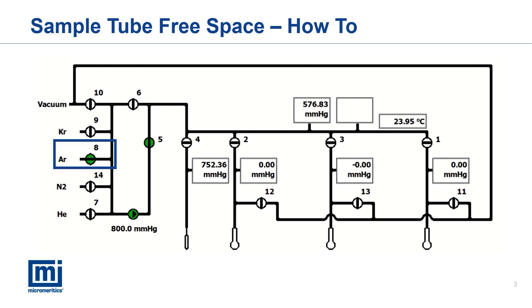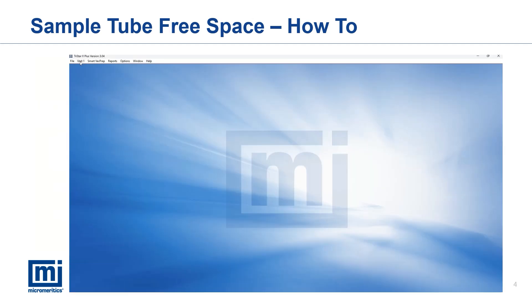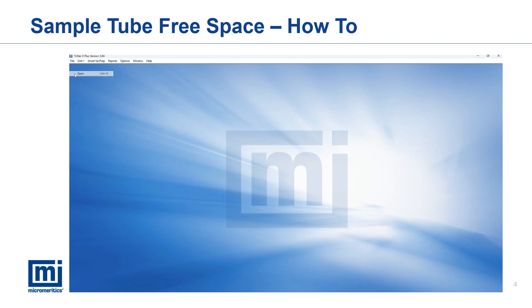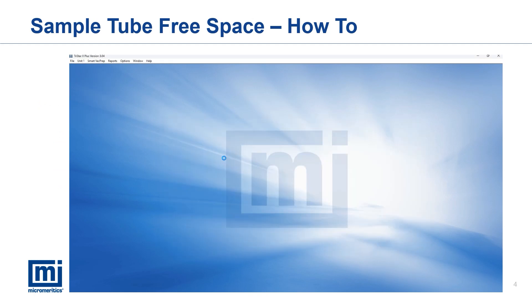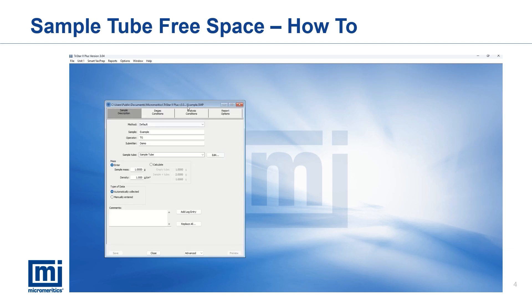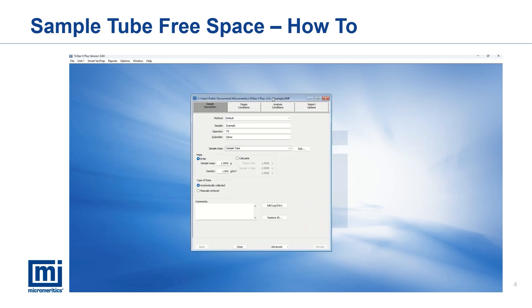After sample tube free space analysis is done, open the SMP file that would be used for testing. To apply the sample tube free space for analysis, on the sample description tab, select the calibrated sample tube from the sample tube drop-down menu.